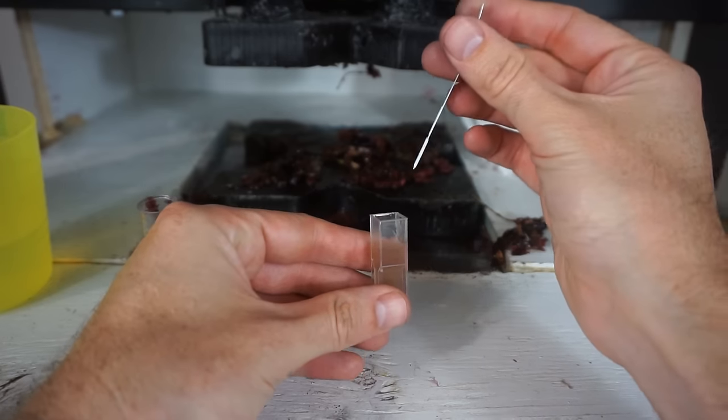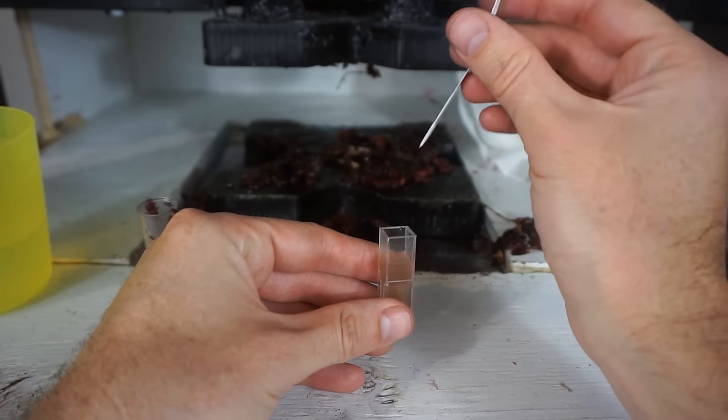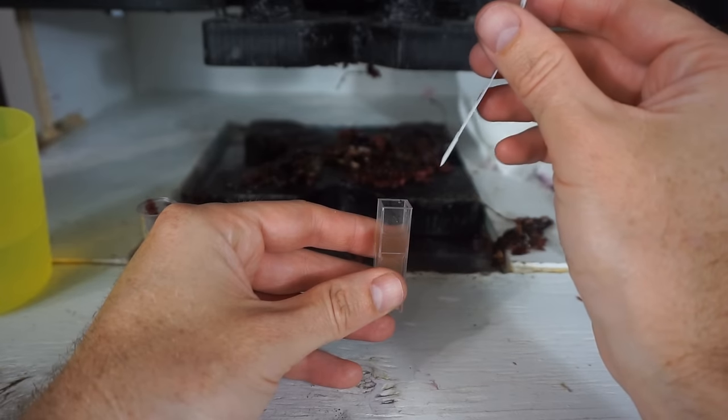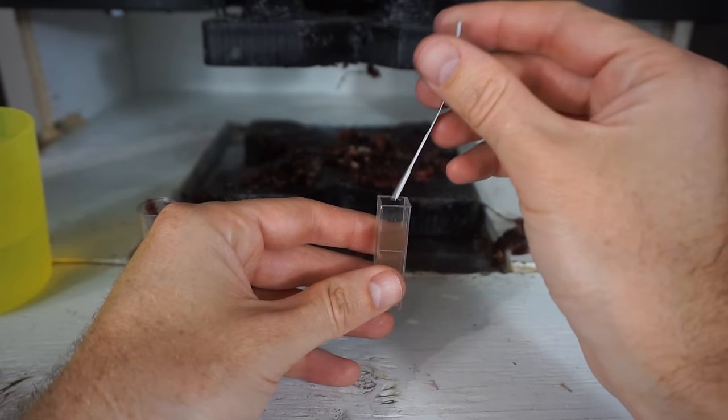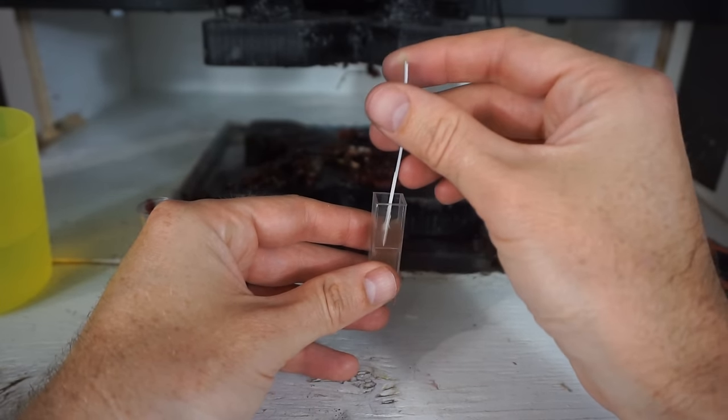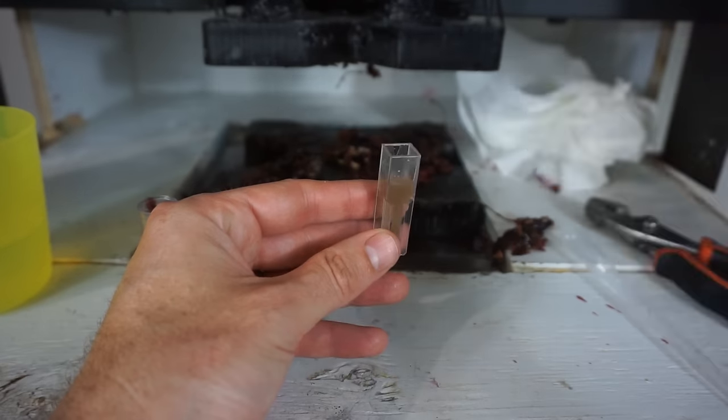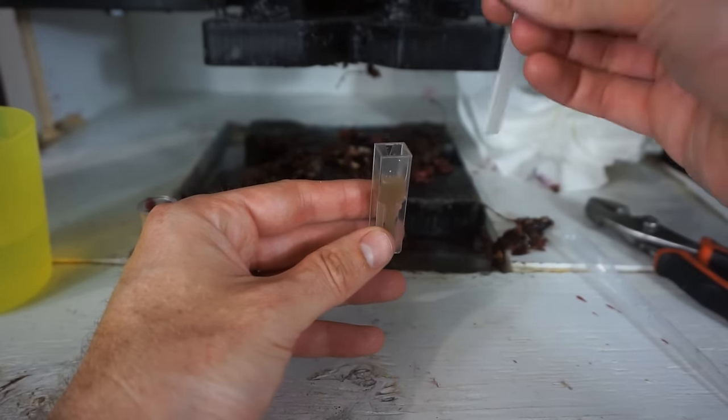Strip number one will turn any cyanide that's in there into cyanogen chloride. And then the next strip I dip in will turn that into a blue color. I have to do this for 30 seconds. Now if there's any cyanide this strip should turn blue.